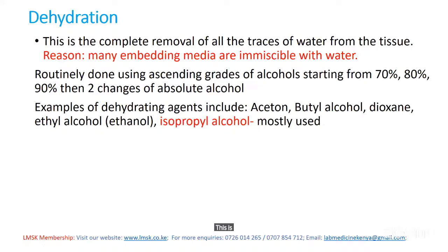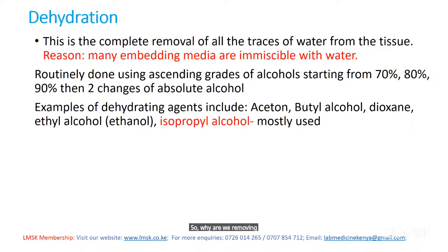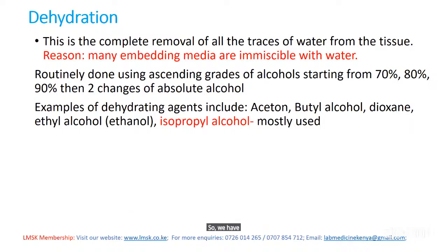This is just the complete removal of all traces of water from the tissue. And why are we removing water from tissues? Because all tissues contain water. Even the fixative that is used contains water. It's because many embedding media are immiscible with water. The most commonly used embedding medium is molten paraffin wax, and that is immiscible with water. So we have to remove all the traces of water from the tissues.